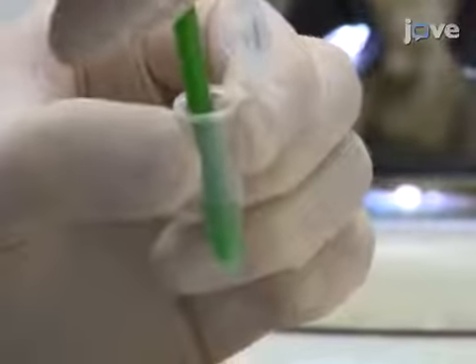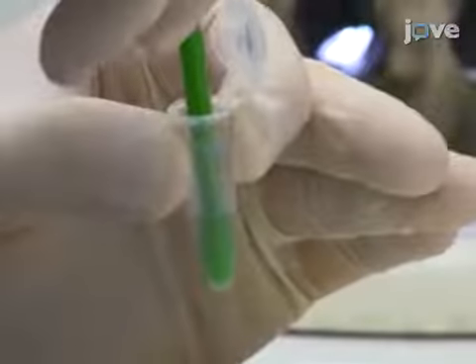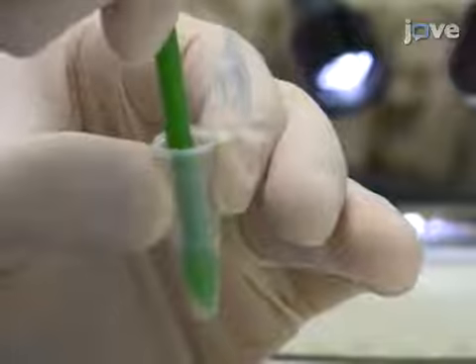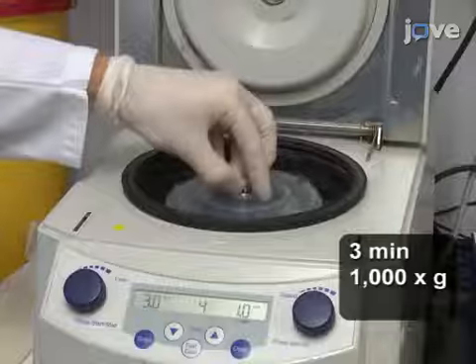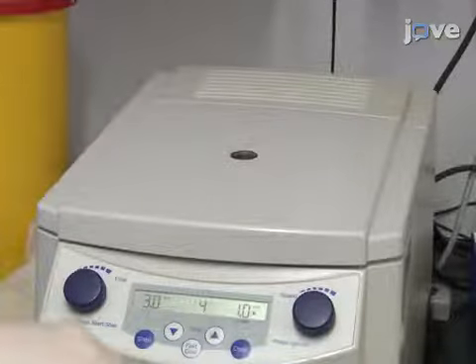Then use a small plastic stick to smash the isolated salivary glands within the centrifuge tube for three minutes in order to isolate the sporozoites from the salivary gland tissue. Centrifuge for three minutes at 1000 times G at four degrees Celsius to purify the sporozoites from the remaining tissue.